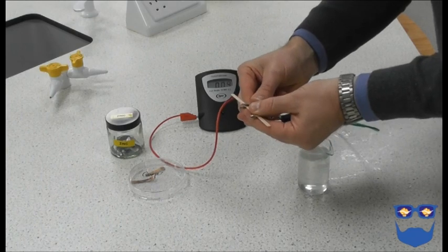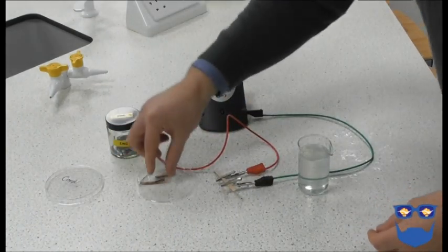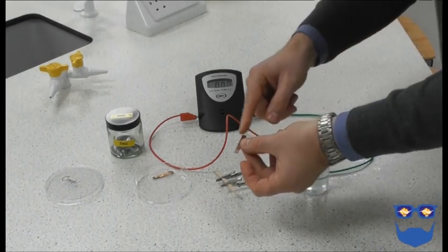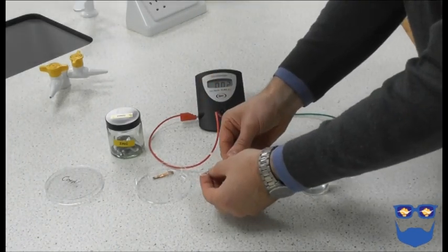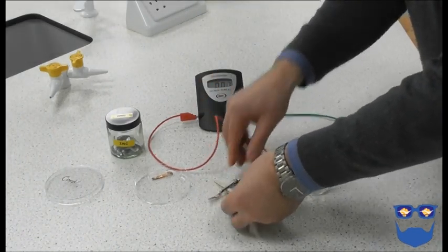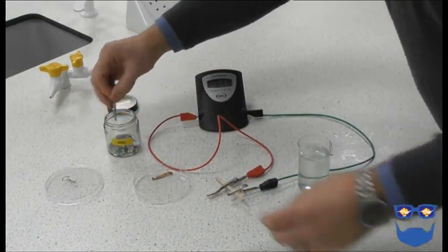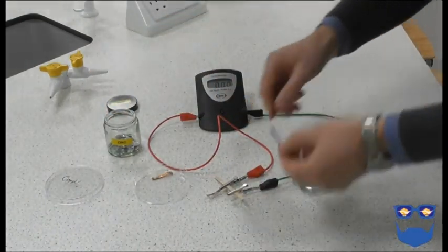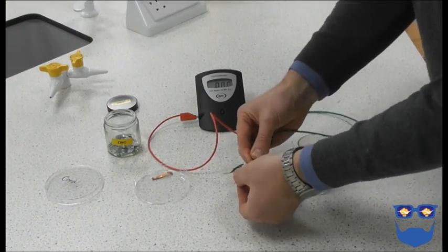I use a splint to ensure the electrodes are kept apart during the experiment. Pick one of the metal strips. I've chosen copper. Clip it onto the lead from the positive terminal. Pick a different metal strip. I've chosen zinc here. Clip it to the lead from the negative terminal.